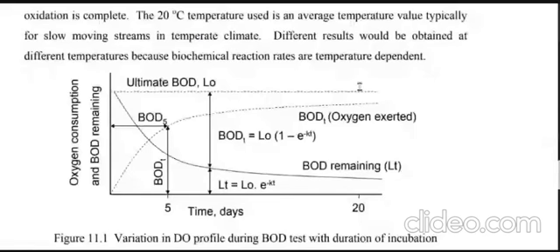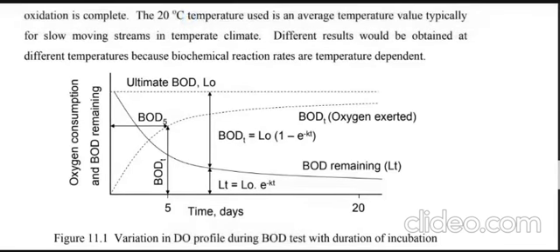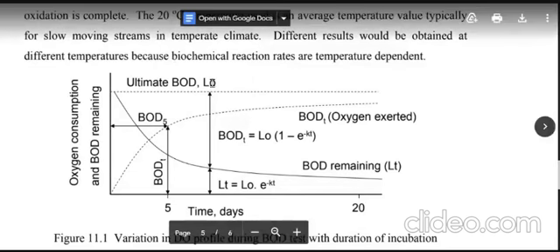Now, BOD is biochemical oxygen demand. So initial BOD gives the concentration of the waste or organic matter present in it. So initially at day 0.